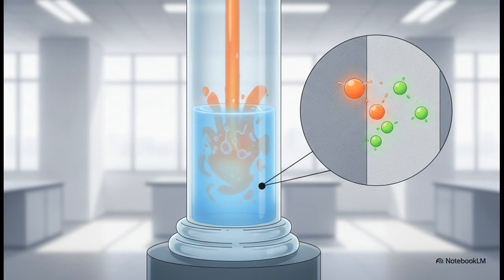Scientists start with a primary solvent, which is completely nonpolar, like hexane or heptane. This acts as the carrying stream. But since our sample molecules are so strongly adsorbed to the polar silica, the nonpolar hexane can't wash them away on its own.